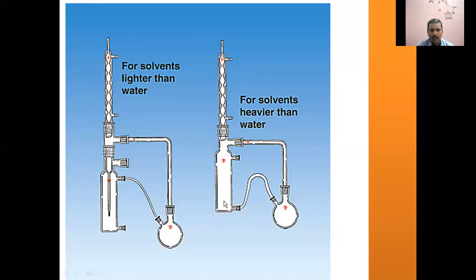So certainly two layers are going to be formed because organic solvent is heavier than water because of its higher density. It will be settled at the bottom. So organic solvent which is collected at the bottom will be passing into the solvent reservoir back. So first vapors of the solvent, then it will pass through the aqueous sample solution, and it will take out all those solutes which have relative solubility in that, and the solution of solute and the organic solvent will come back to this reservoir. So that's what this is, a continuous extraction.